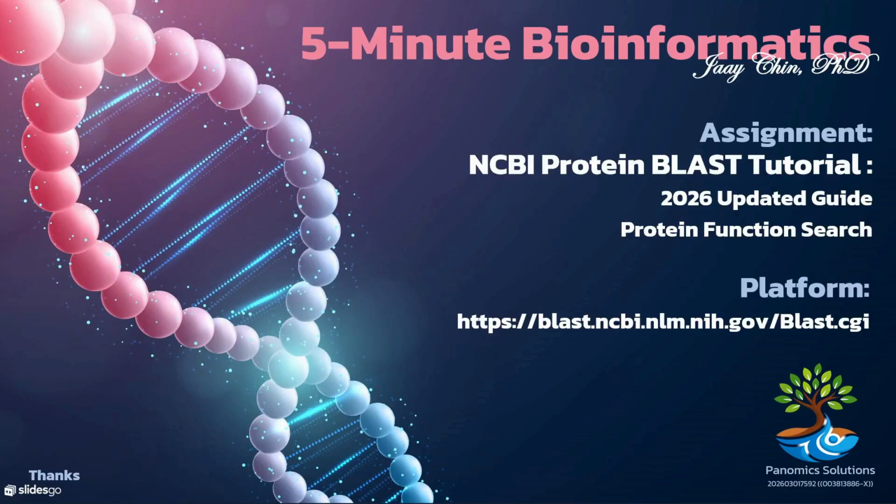In this video, we're going to learn how to use NCBI Protein Blast in this 2026 updated guide. I'll walk you step by step through the process of performing a protein function search, interpreting the results, and understanding how to identify potential functions of an unknown protein sequence. By the end of this tutorial, you'll be able to confidently run a protein blast search and analyze the output for functional annotation. Let's get started.